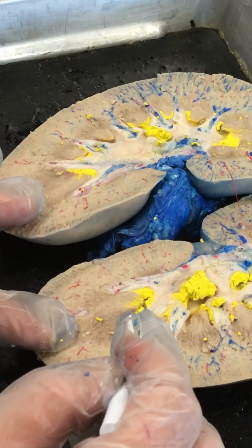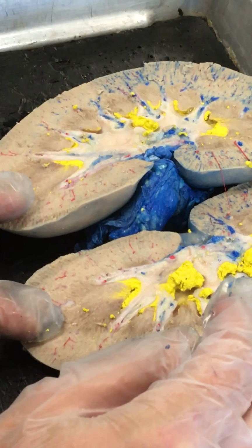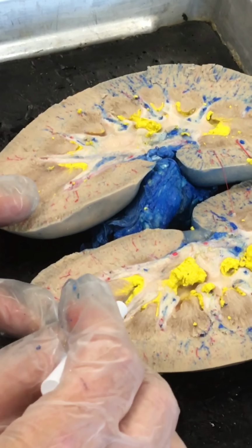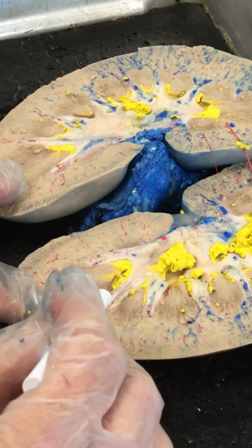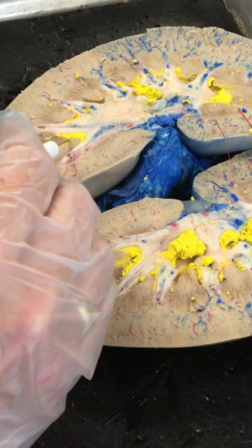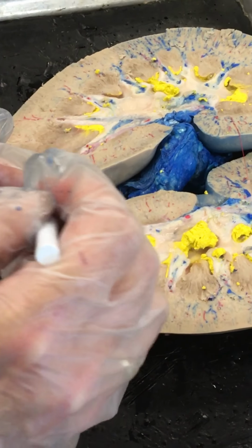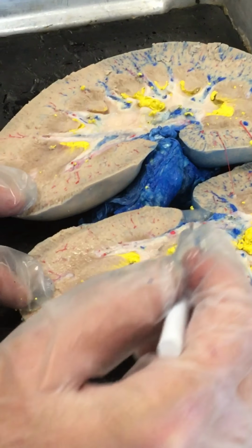So the tips of the renal pyramids are the renal papilla. So you can kind of see they form that kind of, again, where you've got the yellow coming down in. That's where the urine would actually be passing through the tubes and entering into the calyces.